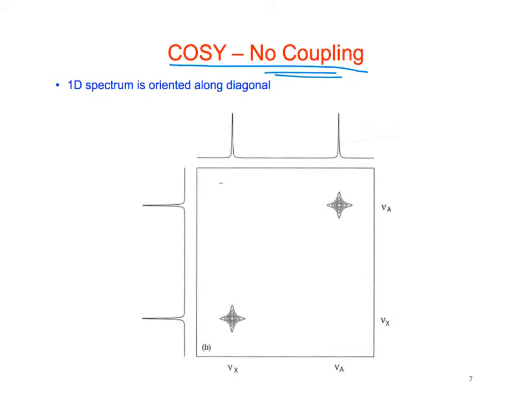The way that this is drawn out, it's a contour plot, right? We see two peaks, and the height of the peak is determined by the number of contour lines. Oftentimes these will be colored too.